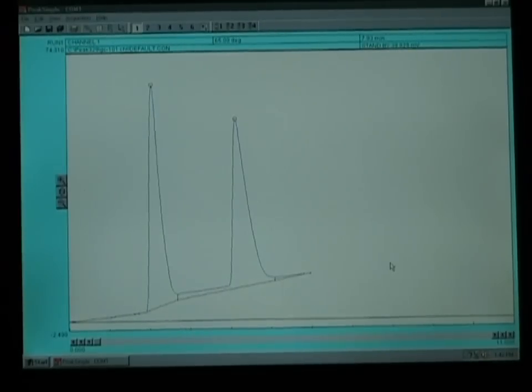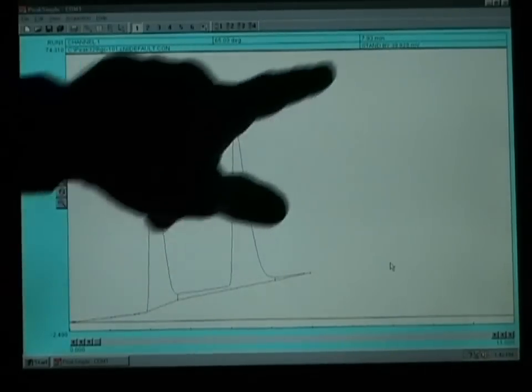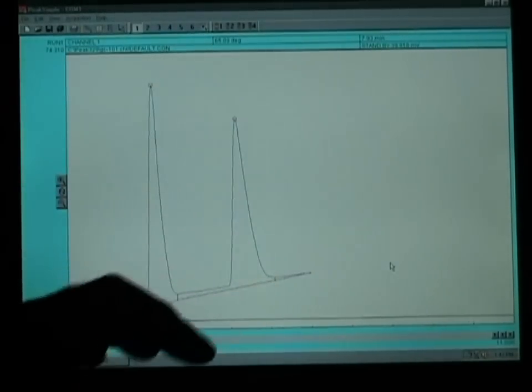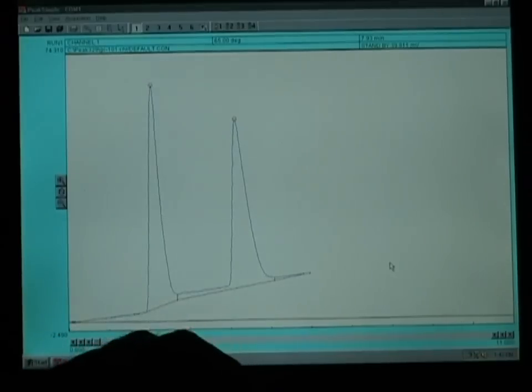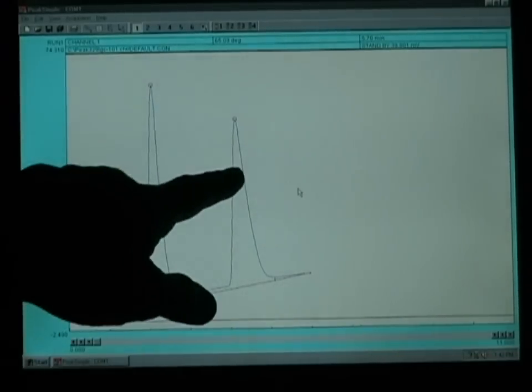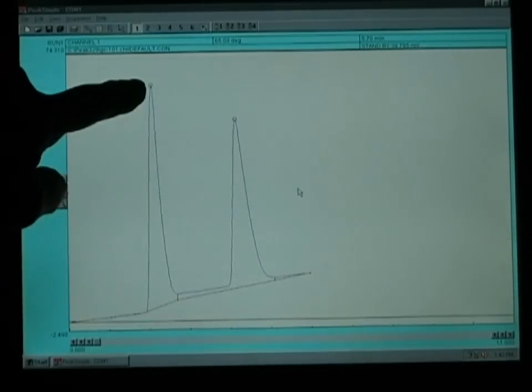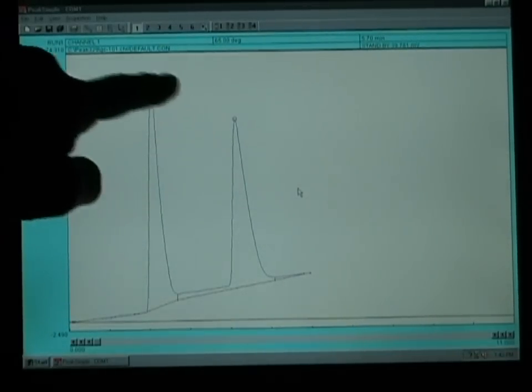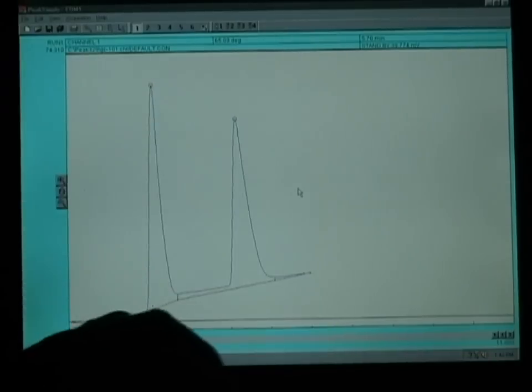When the chromatography is complete and the system returns to the standby mode, we can see that our primary components are marked by little red circles at the tops of the peaks.